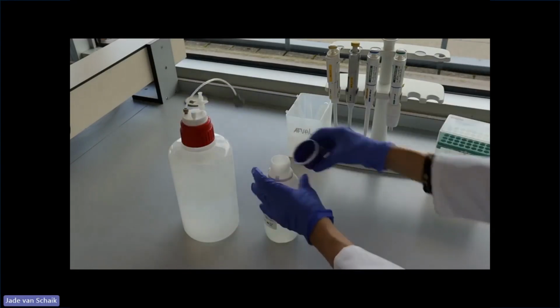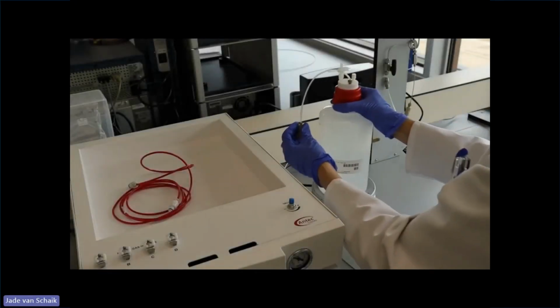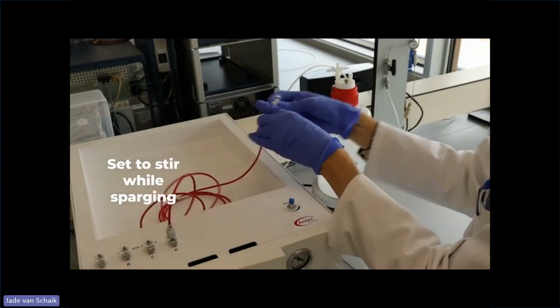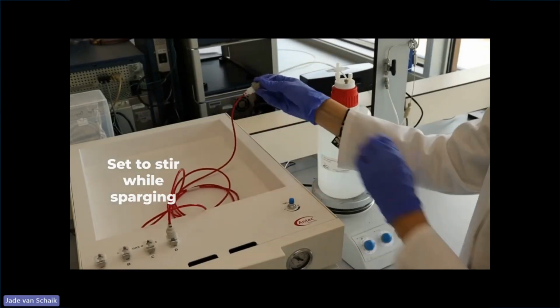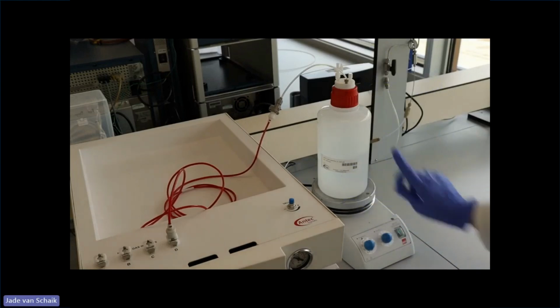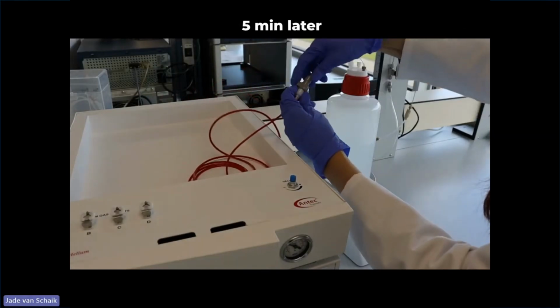And quickly close the bottle with sodium hydroxide too. Set the solution back on the stir plate, connect the sparge line and make sure to open the vent. 5 minutes later, the bottle can be disconnected and closed.